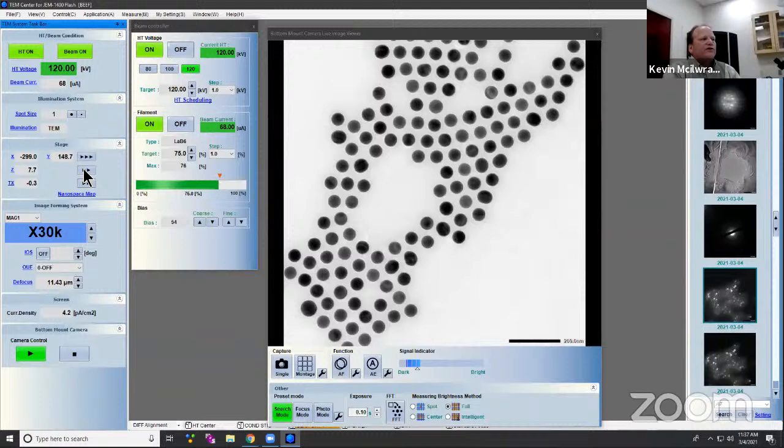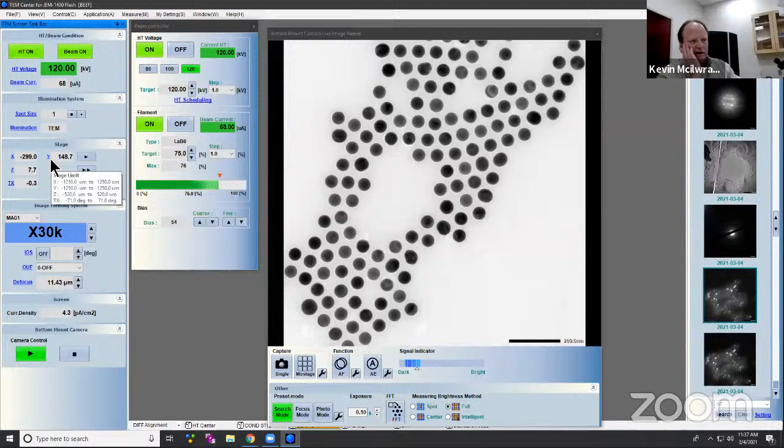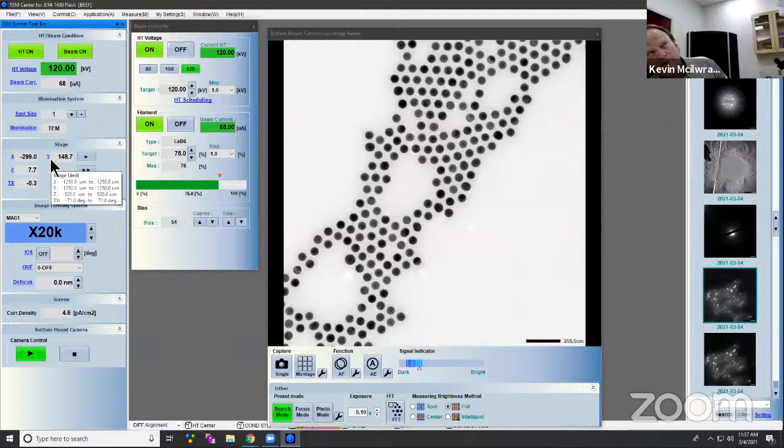So we have a range, but then one of the things on the stages, and imagine this, back in the day before I started working on TEMs when I was 29, when digital stages were just introduced, back in around the early 90s. And before that, imagine you have only two speeds. I think FEI used to make a tool called the Morgagni, which was a 100 kV TEM, which competed against our 100 kV.